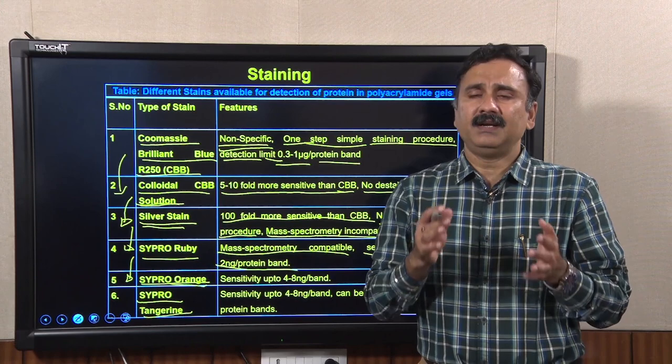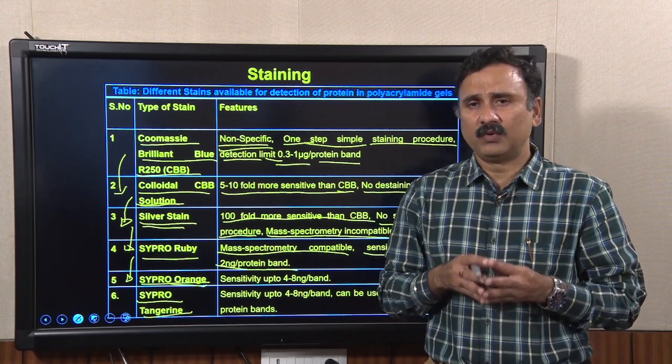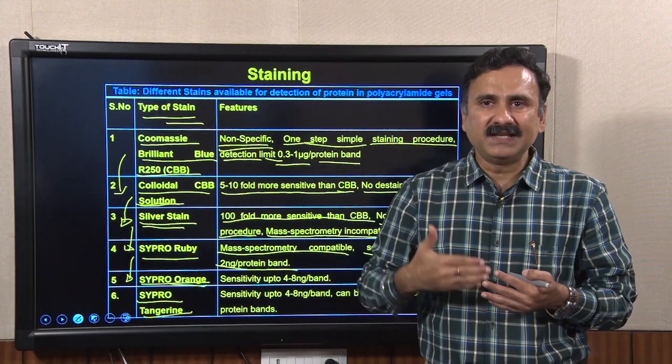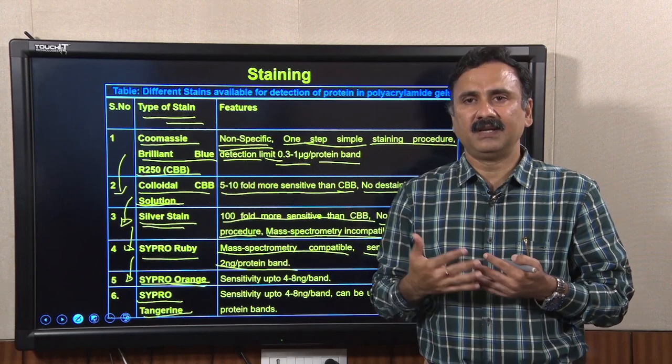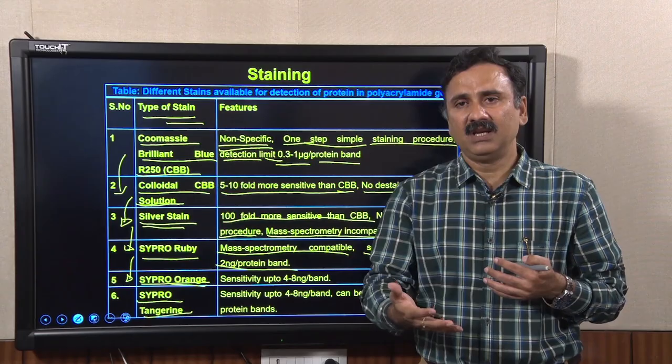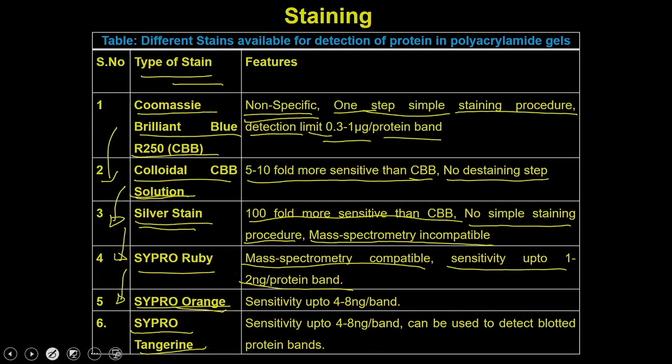In a typical staining procedure, you first take the dye and prepare the staining solution. Once you prepare the staining solution, you incubate the gel in the staining solution, and then you perform the destaining steps, or in some cases the destaining step is not required. To explain the staining procedure, we have taken Coomassie Brilliant Blue as an example.